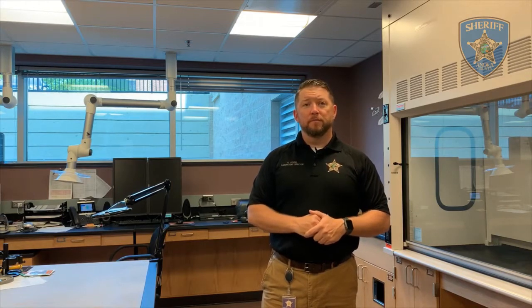At the Midwest Regional Forensic Laboratory, we have 3 main areas of testing: biology, drug chemistry, and latent prints. And during this week, we're going to have videos that will have demonstrations of how evidence is handled and processed in all of those different areas of processing. So welcome to the Midwest Regional Forensic Laboratory.